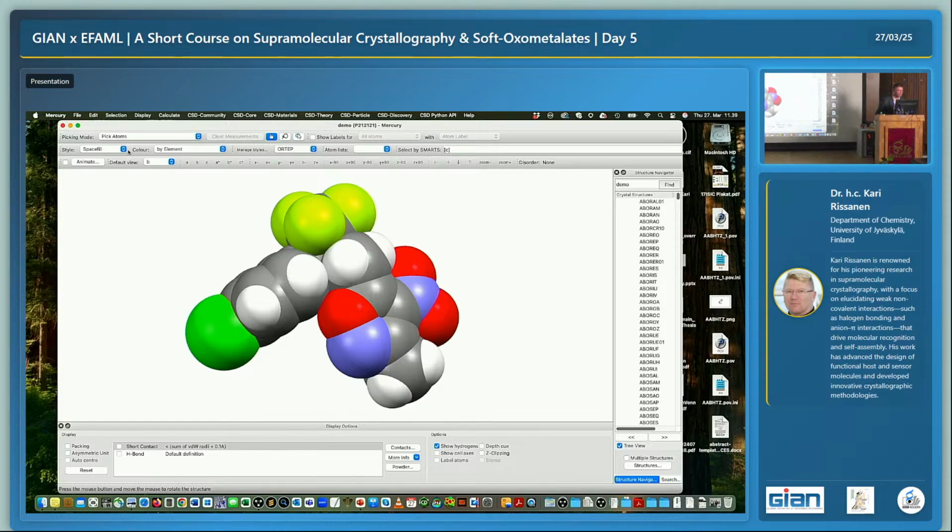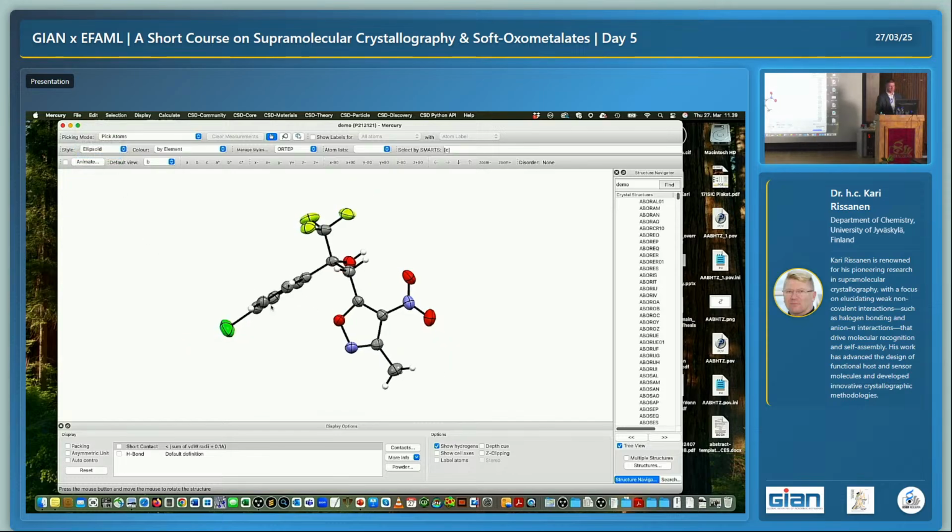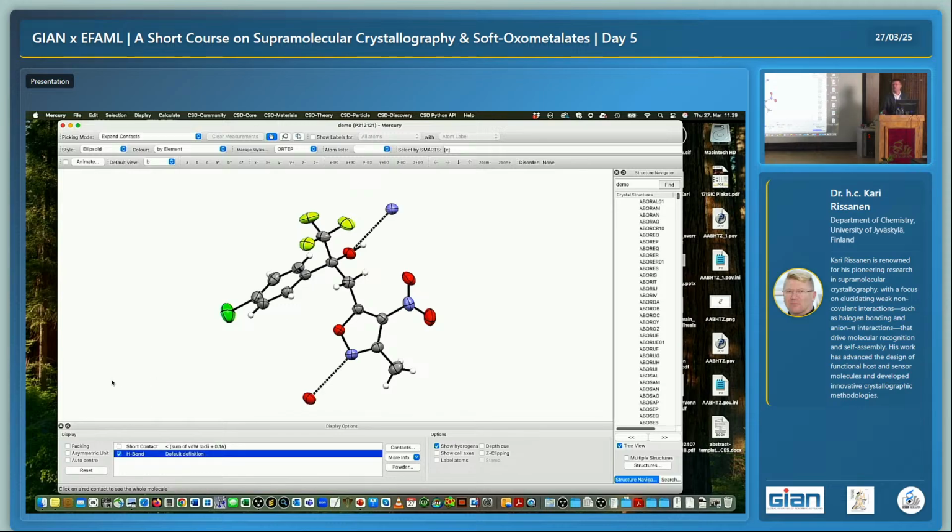But I will show you now very briefly about the hydrogen bonding. I will go back to ellipsoid presentation like this. And now here in the lower part, there is a nice knob which says, look, hydrogen bonds. And now it is looking, but now it's not doing anything more than just looking for what is the nearest acceptor atom. Because here is a donor. Now, this donates hydrogen bond. But now in here, there is no problem. This is an acceptor. But now it thinks that there is now a molecule here, or atom, which could be the donor.